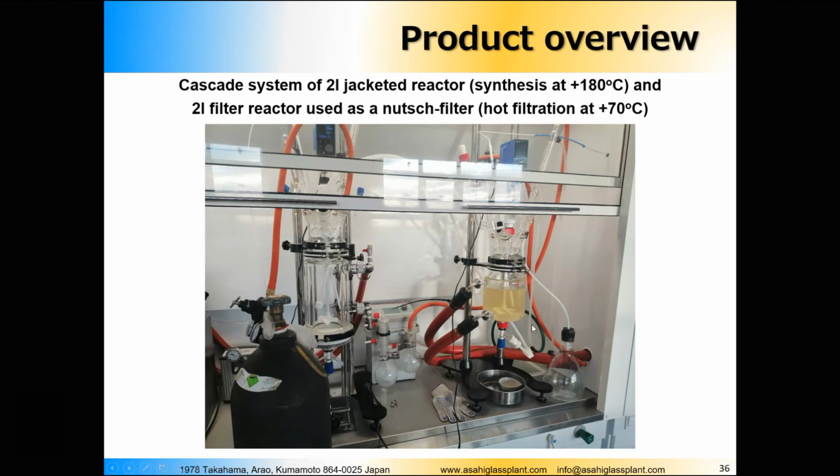It's not really very well seen here on the picture due to those rods of the fume hood, but here we have the connectors that connect the outlet of the reactor with the inlet. Here we have the adapter, and you can see maybe here the PTFE tube which goes inside the filter. So when we apply the vacuum to the system, unfortunately, the receiver is not connected here now because it was under cleaning. The system was under cleaning when I took this picture.